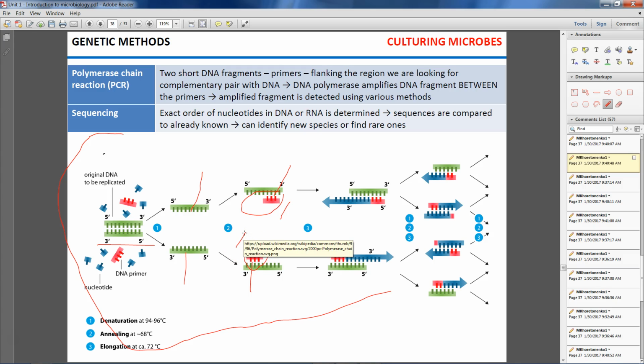Then you add enzyme, DNA polymerase, that starts to copy your DNA. It starts from the primer and it goes and goes and goes, maybe longer, shorter. So in the very first round, you're going to have fragments of different length. You see there is no termination sequence.